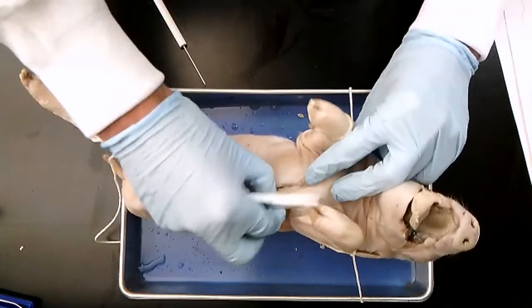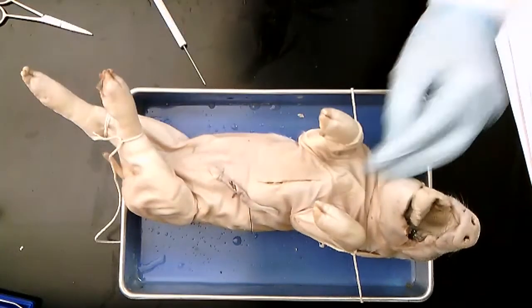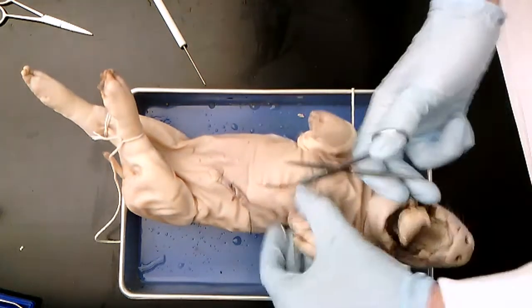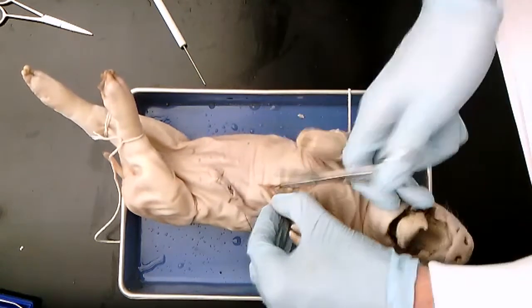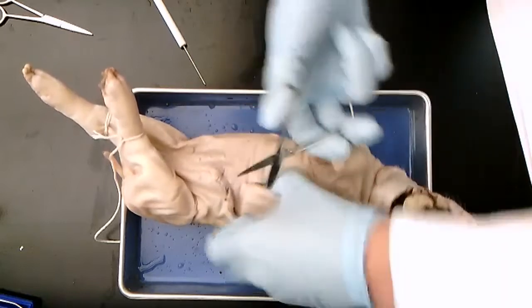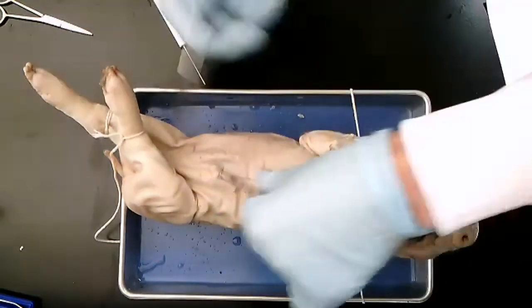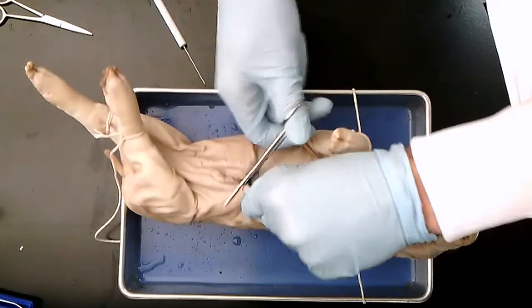And once I start the incision, I recommend taking your scissors at that point because it's a lot easier to have a successful dissection without rupturing anything. The scalpel, it's much easier to cut through. When you get to the umbilical cord, I like to curve around it on both sides, and that's going to allow you to start to make a flap.